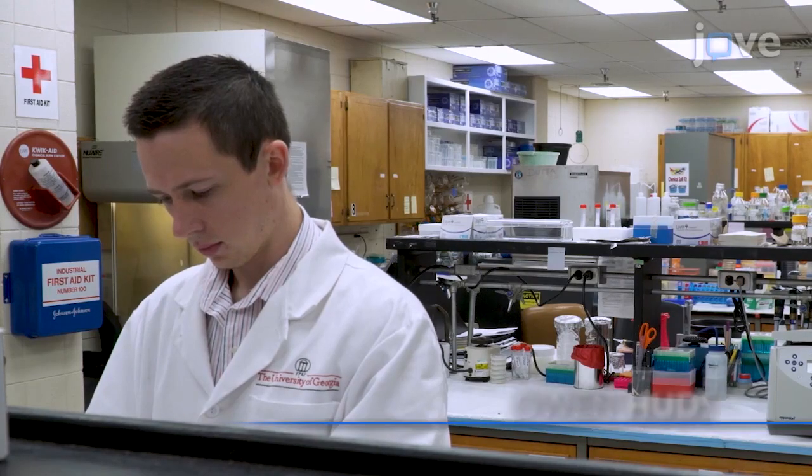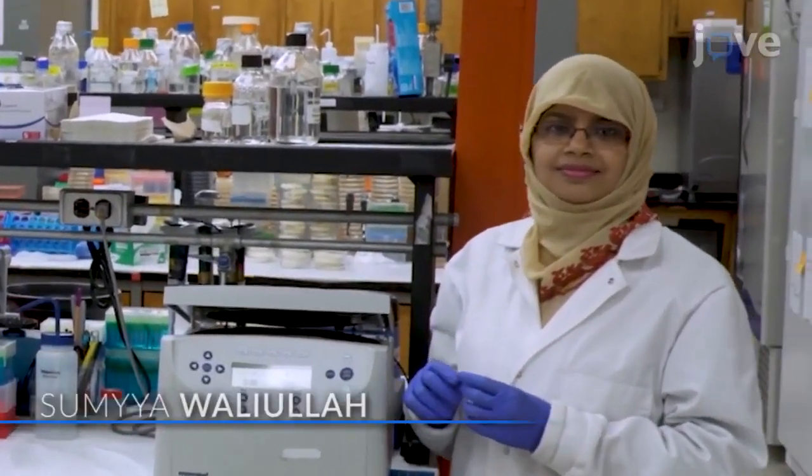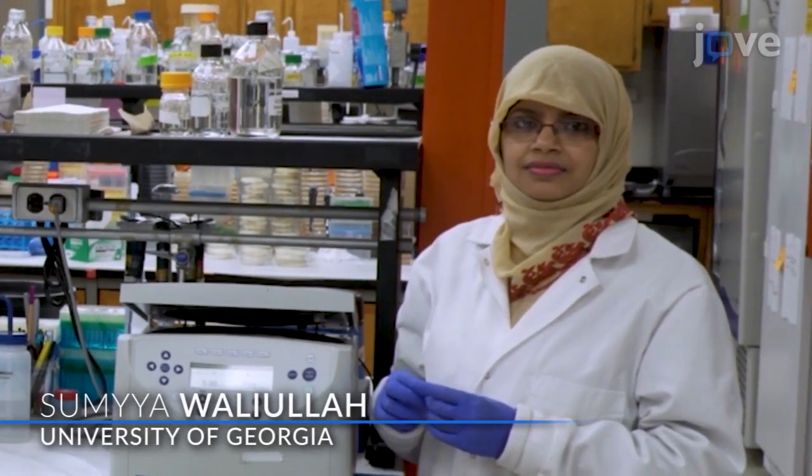Demonstrating the procedure will be Owen Harsin, a master's student from my laboratory, and Sumaya Waliullah, a postdoctoral researcher from Dr. Pingxingji's laboratory.